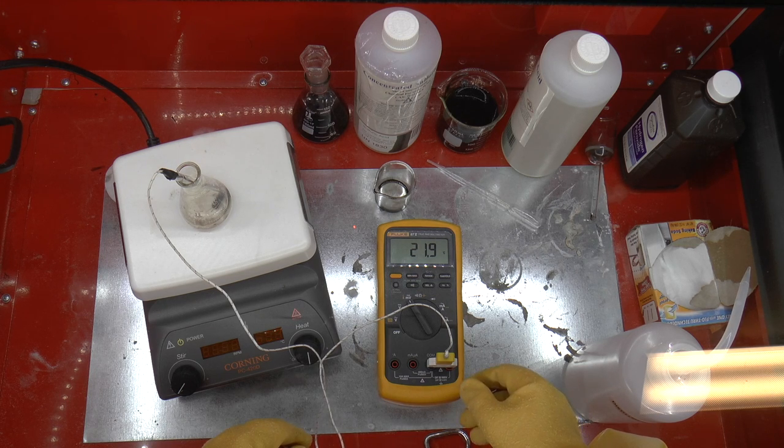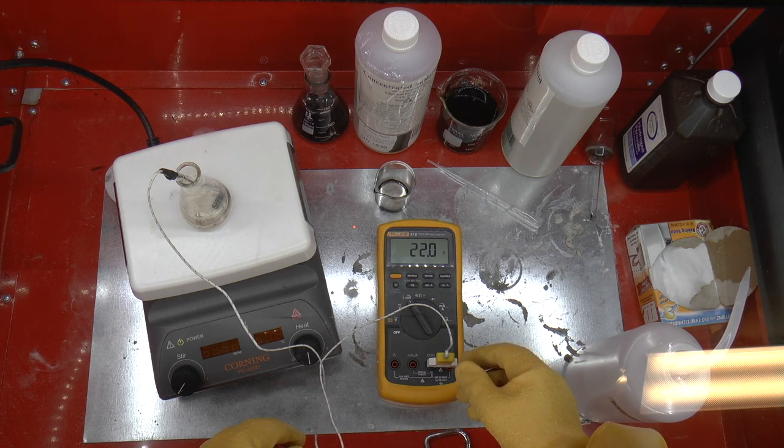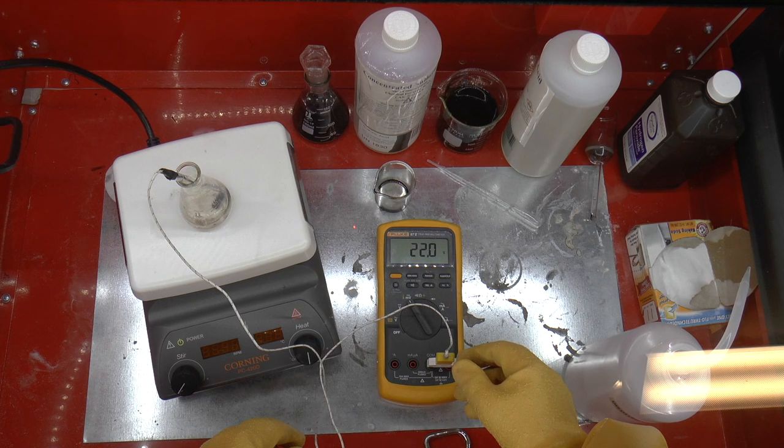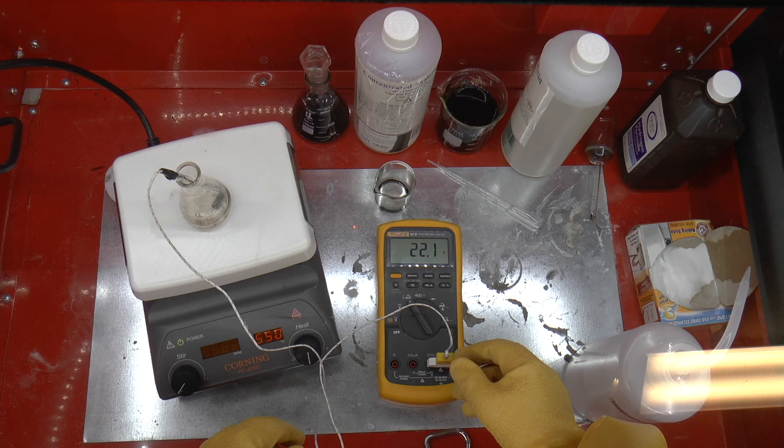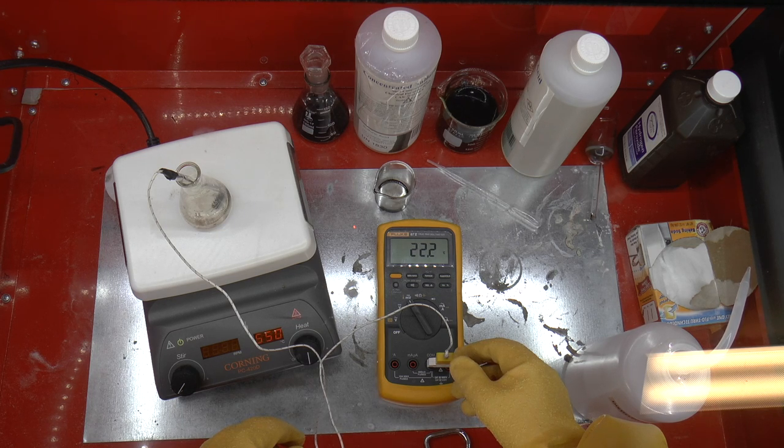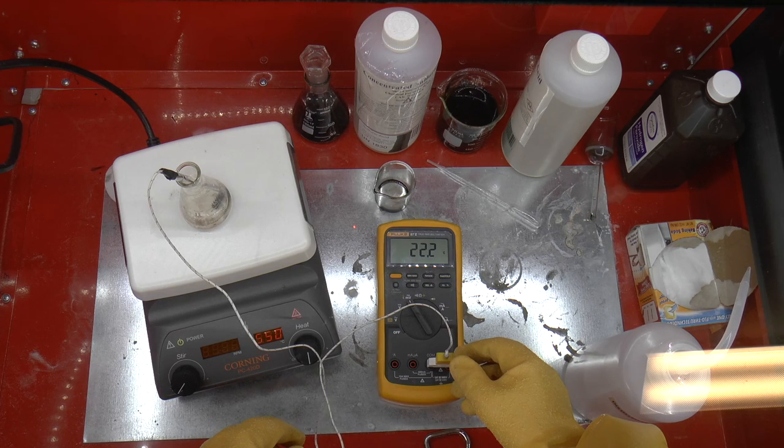200 Celsius is hot enough to essentially melt or actually oxidize or dehydrate the plastic resin that forms the plastic body of the chip. Since this can get pretty boring, we're just going to fast forward.